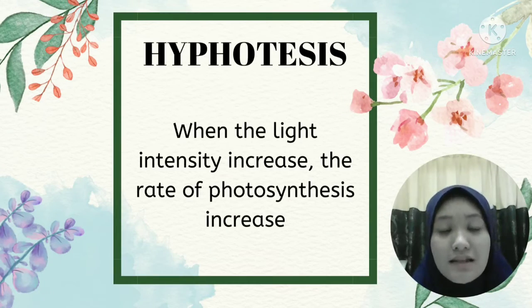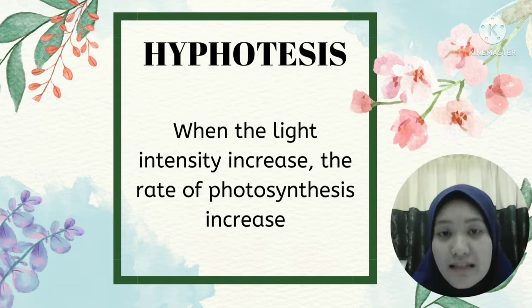So, what is the hypothesis of this experiment? The hypothesis is when the light intensity increases, the rate of photosynthesis also increases.